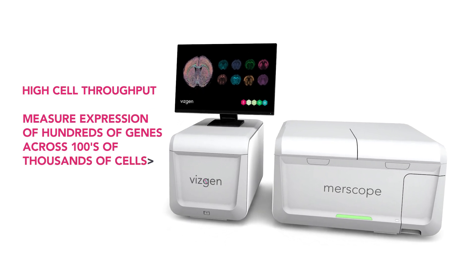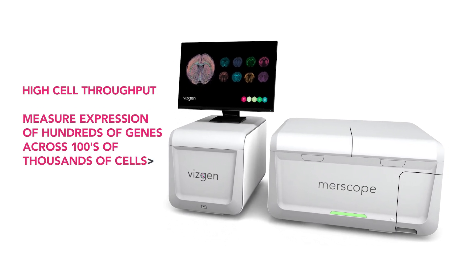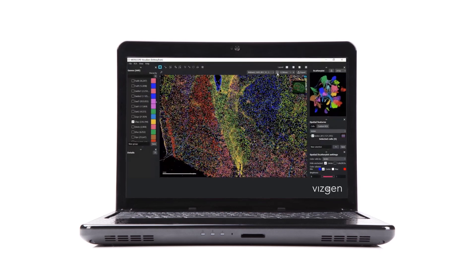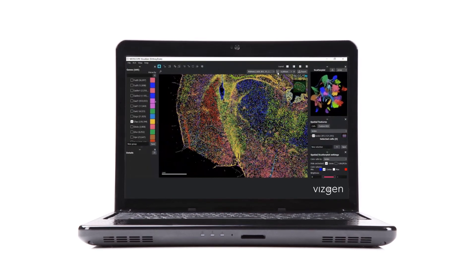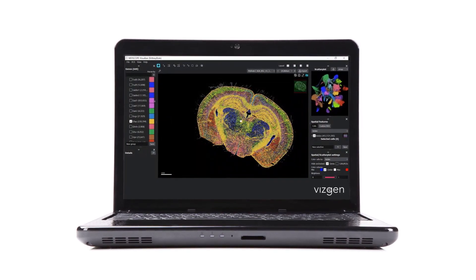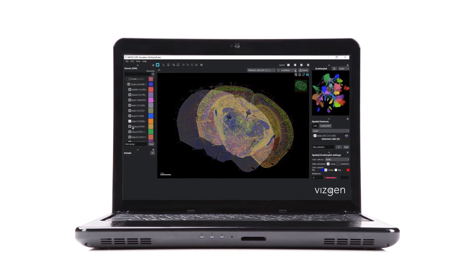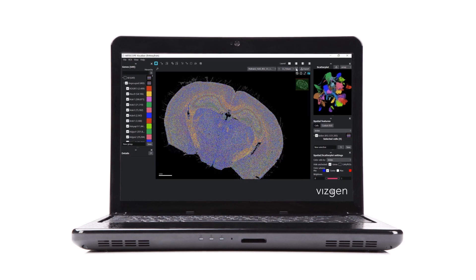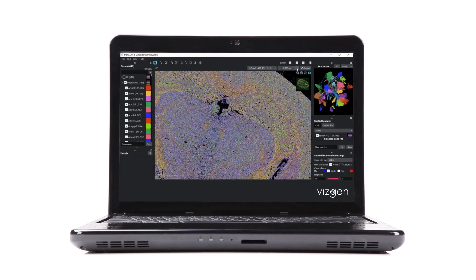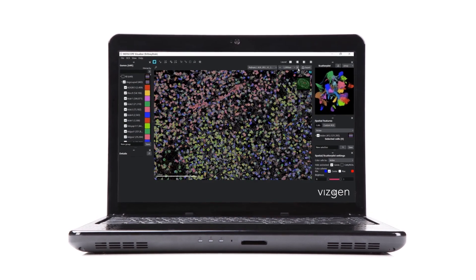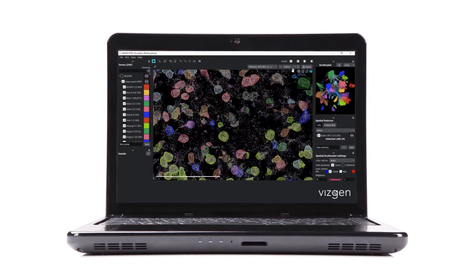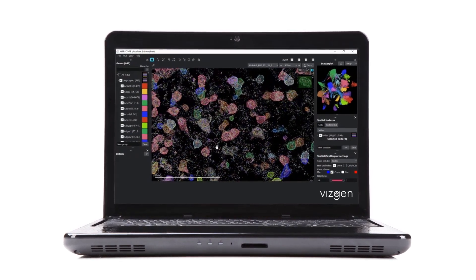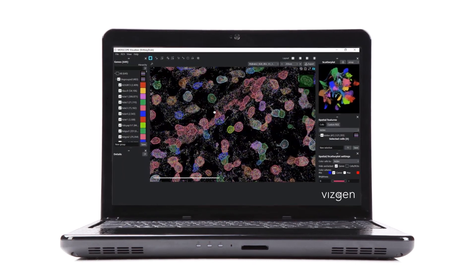With MRscope, you can atlas the molecular composition of a full tissue slice with single molecule resolution for a panel of up to 500 genes. The MRscope visualizer software enables users to interact, analyze, and interpret even the most complex MRFISH data sets.